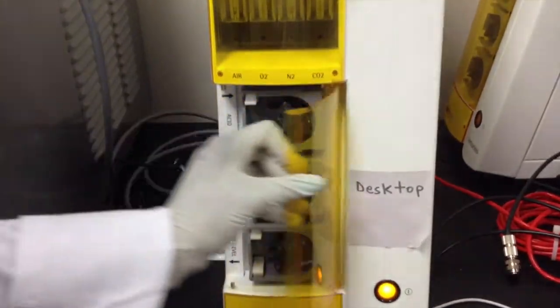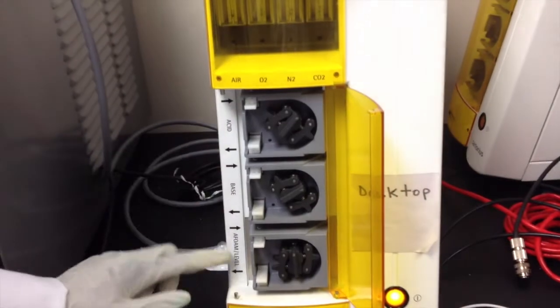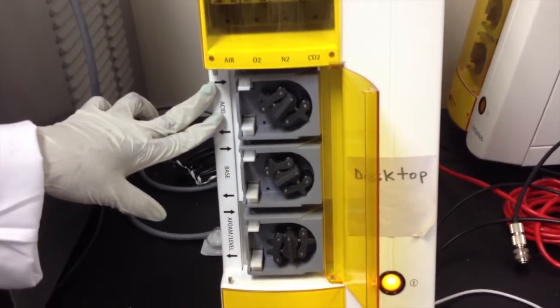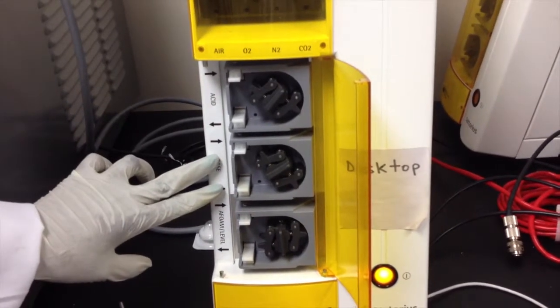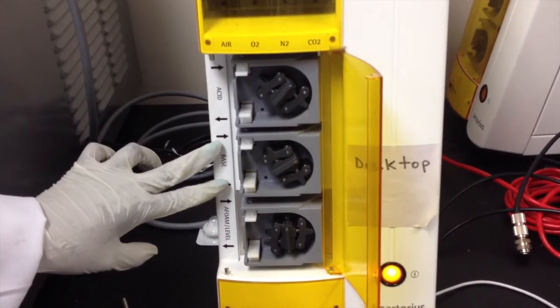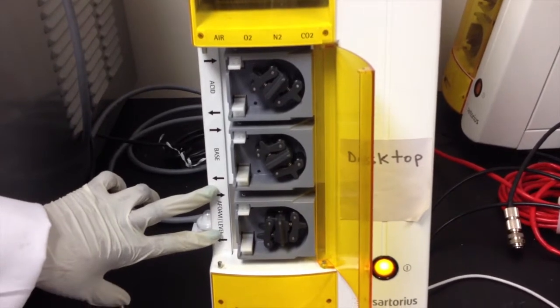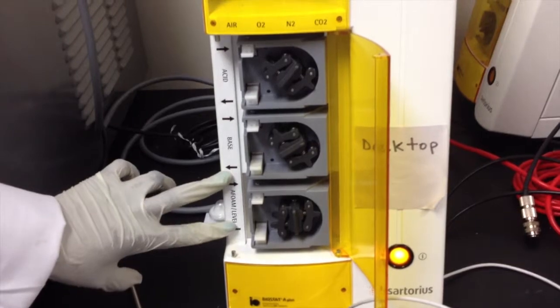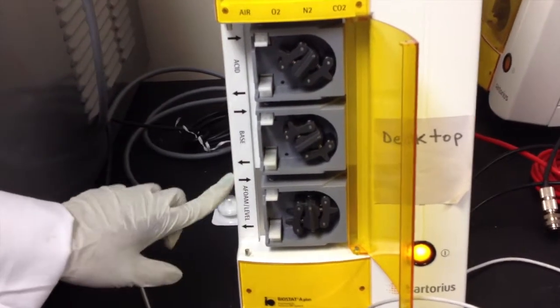The second part is used to maintain pH and the antifoam levels. Acid is added if the media becomes too alkaline, and base is added to maintain the pH if the media becomes too acidic. And antifoam is added because when the cells are being mixed, foam accumulates on the top of the media. And in order to decrease contamination, you use antifoam.